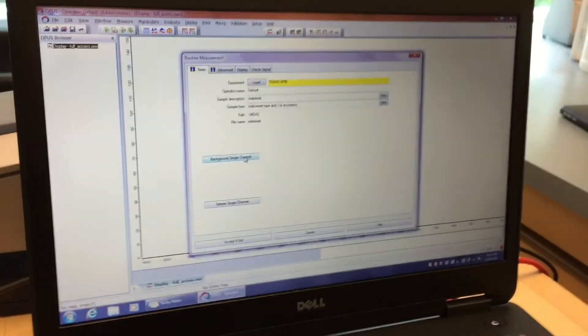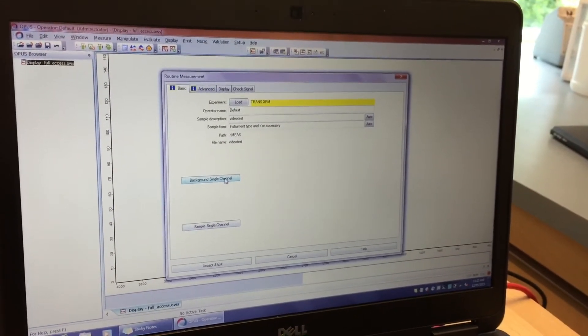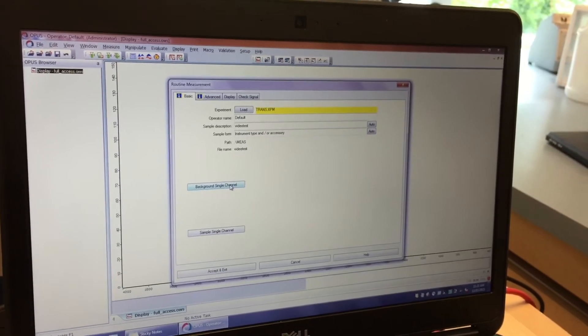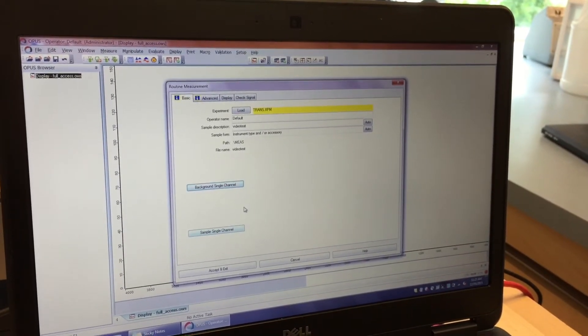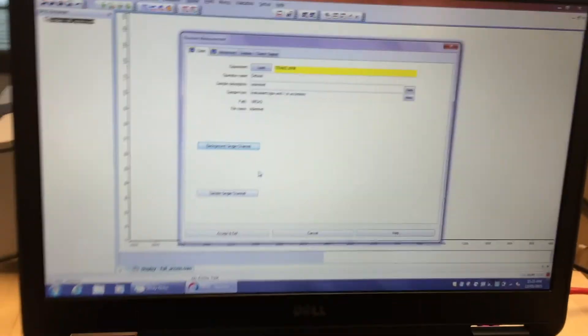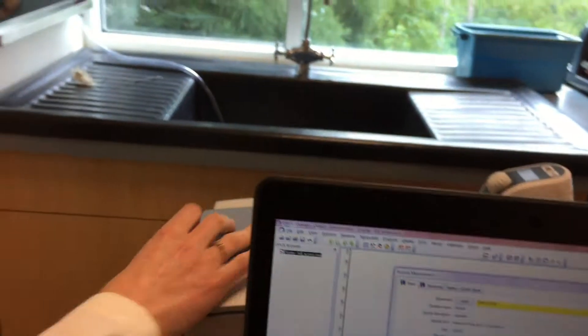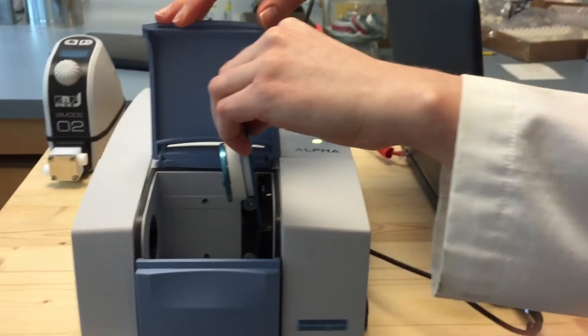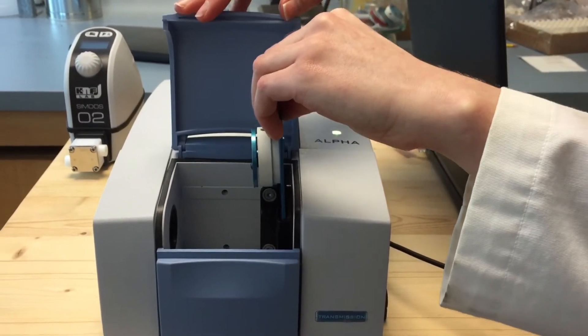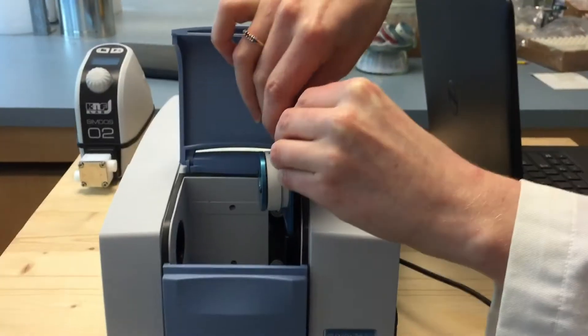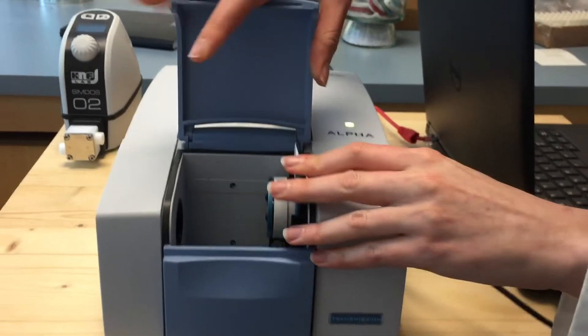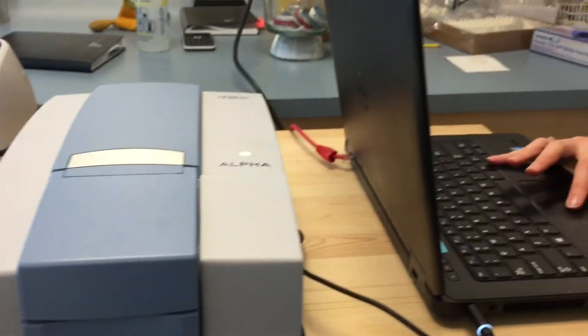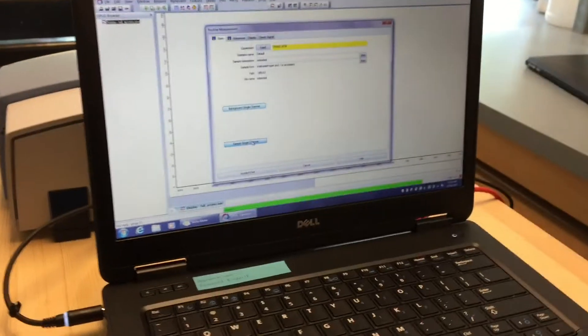Now we can inject a sample into this cell and then choose the sample single channel. We're going to take this out and then put it back the same way around as you did last time, because you want it to measure the same.